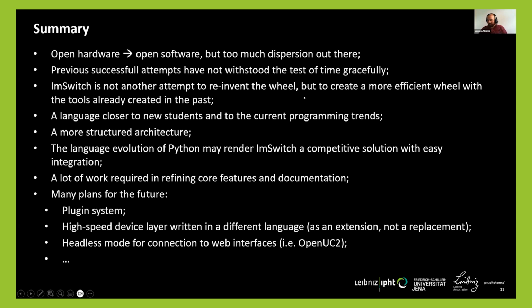But I want to stress that ImSwitch is not an attempt to reinvent the wheel, but rather to create a more efficient wheel. So taking what's out there already and trying to push it together into a more cohesive community that is capable of using all these tools together from a single entry point. And to me, it also looks like a strong point.